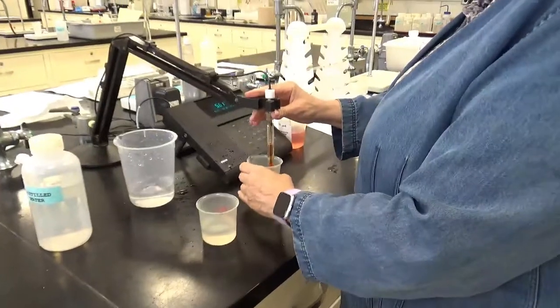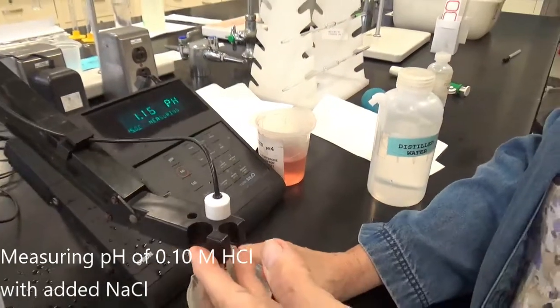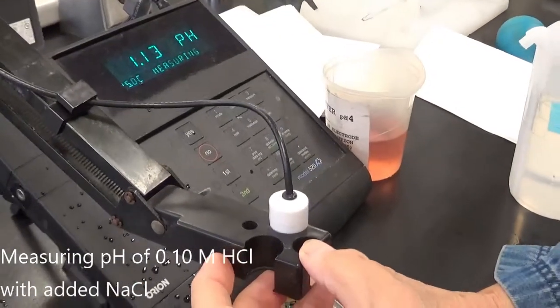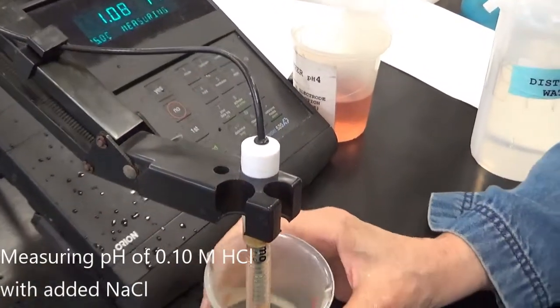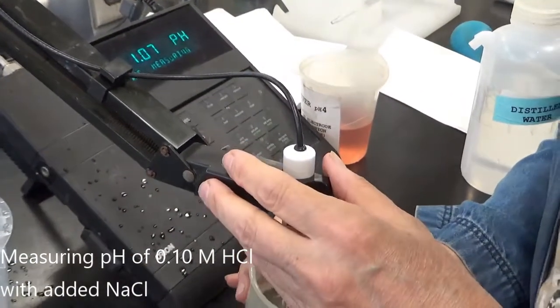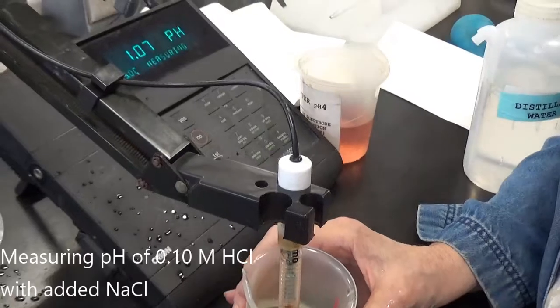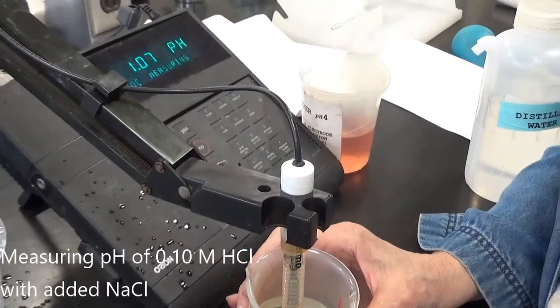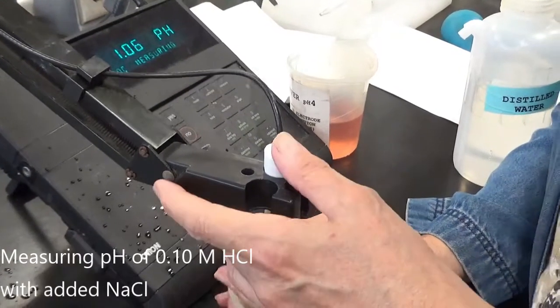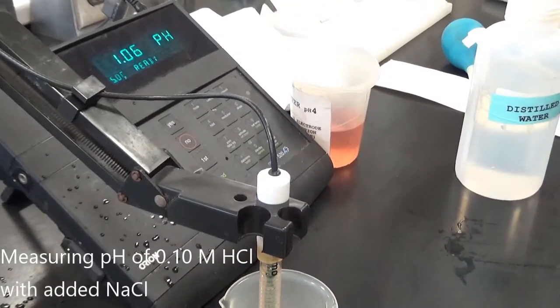And here is the NaCl with HCl. I don't know if this is enough. I think so. Okay, now you can see the reading of the pH. Let's wait till it beeps. I should have put this in a smaller beaker. It's beeped. 1.06 is the pH.